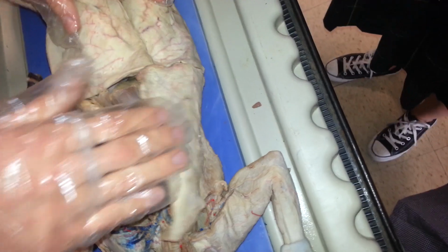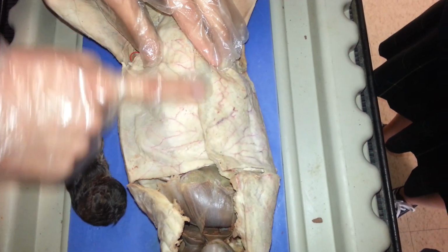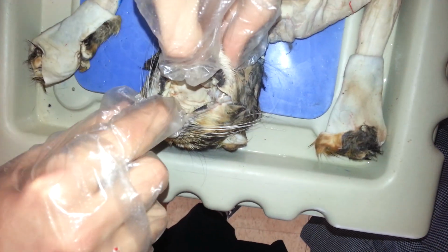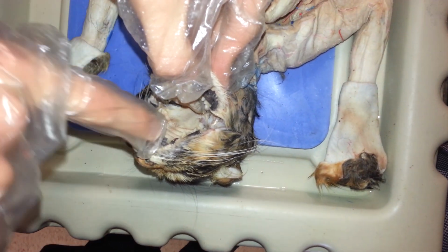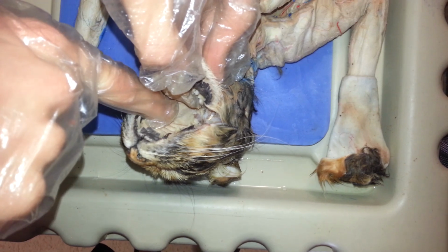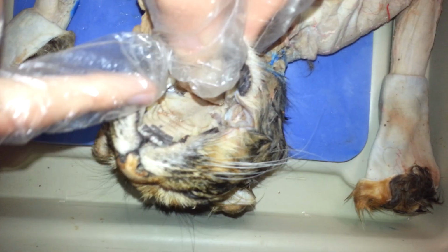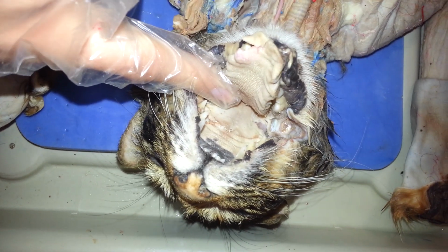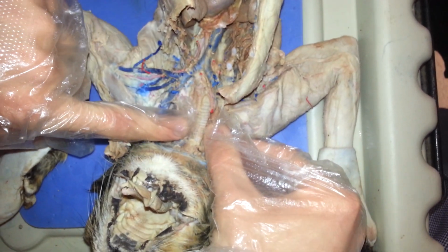Rectus abdominis is the muscle that covers the abdominal cavity. The hard palate is the beginning of the top of the opening of the mouth, and the soft palate is towards the bottom. The hard palate is made up of bone, and the soft palate is made up of muscle. The glottis is the entryway all the way down into the mouth, and it branches off into the esophagus and trachea. The trachea is right here, this bone that leads to the lungs.